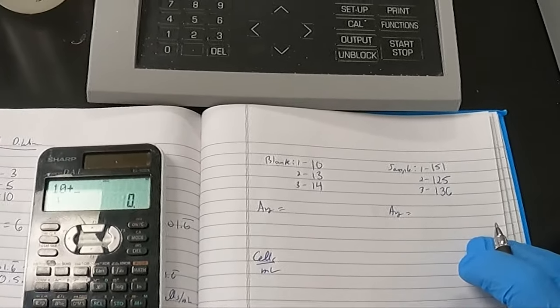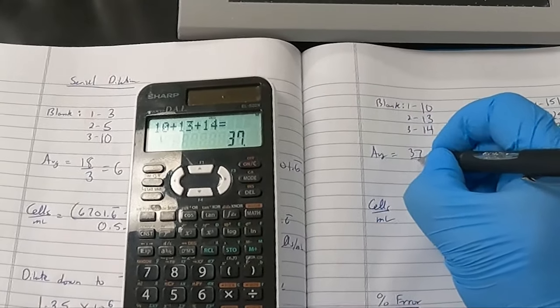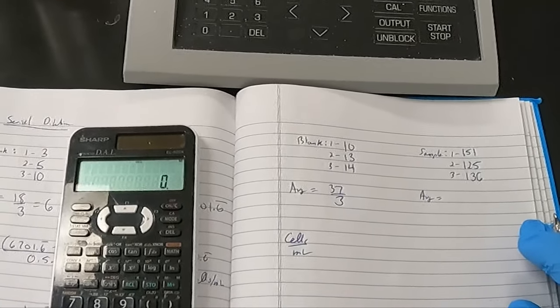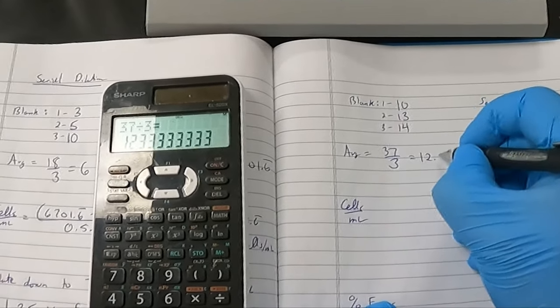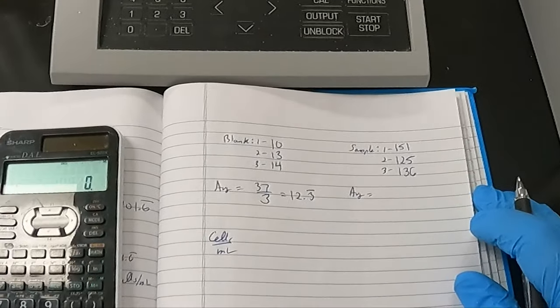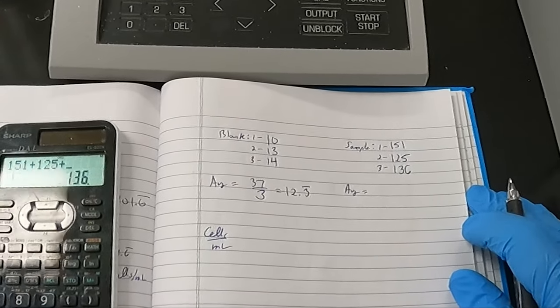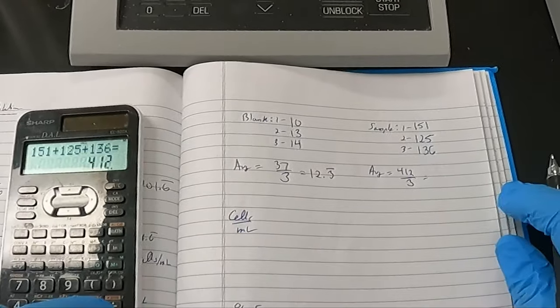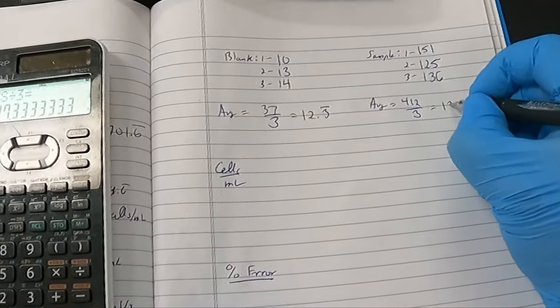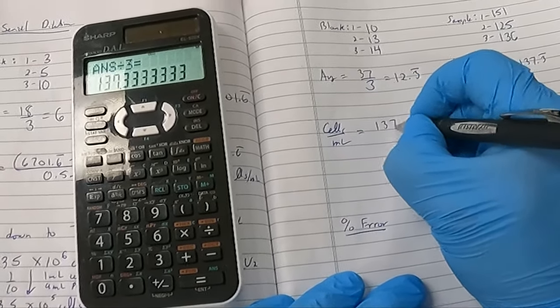Let's take our averages. 10 plus 13 plus 14, 37. Divide by 3. 12.3 repeating. Remember, don't round off until the final answer. 151 plus 125 plus 136, 412. Divide by 3. 137.3 repeating.